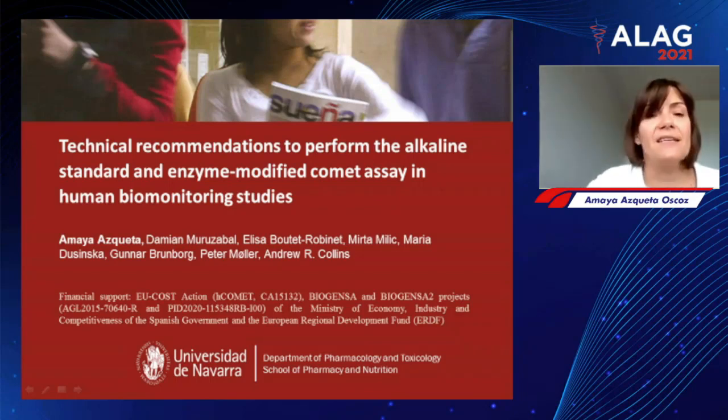The title of my talk is Technical Recommendations to Perform the Alkaline Standard and Enzyme-Modified Comet Assay in Human Biomonitoring Studies.